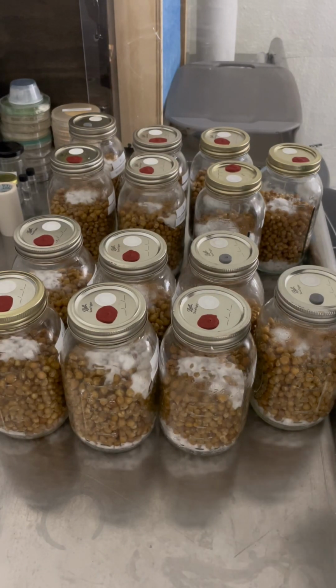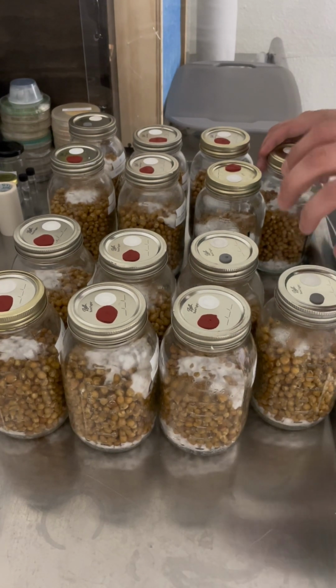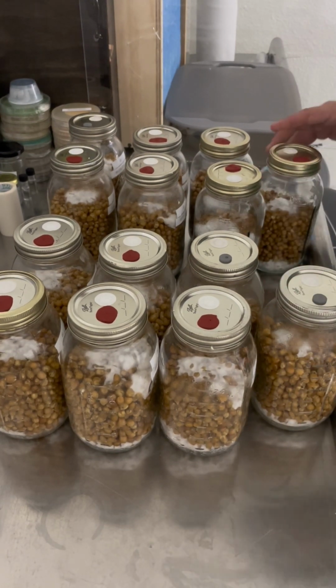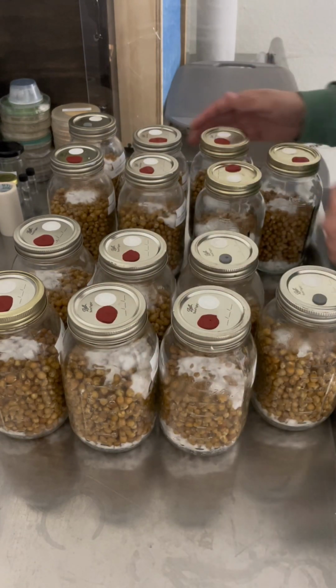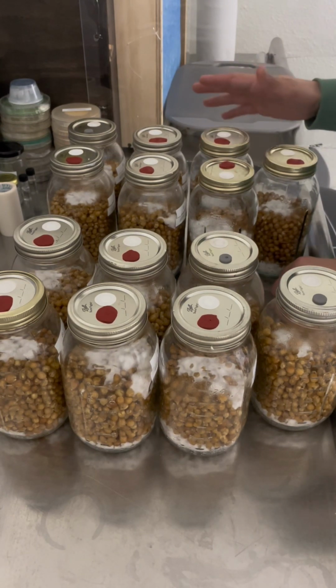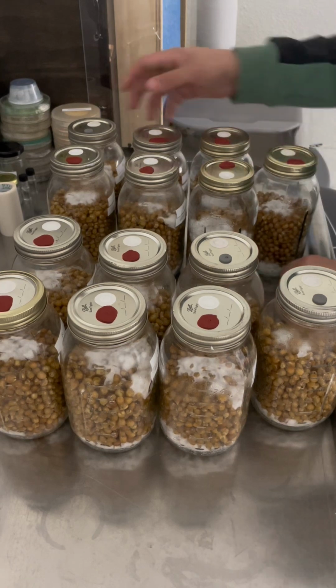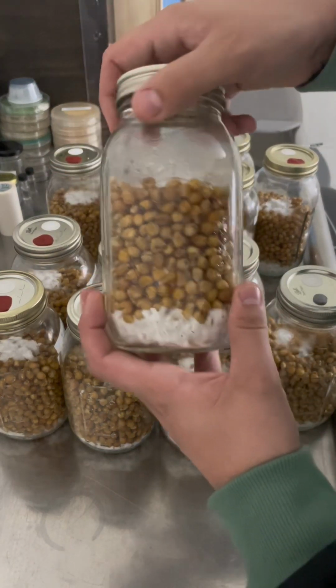All right, guys, the date is December 31st. It's New Year's Eve, and it has been 13 days since I inoculated these. These ones right here, the regular, no sugar added. These are the drippy corn with the corn syrup. And I'm gonna be honest with you guys, I'm actually a little bit surprised. I thought that the drippy corn would just blow them out of the water, but they're looking pretty similar right now. I'm gonna be doing a break and shake today, and then after that, I'll have a better idea.